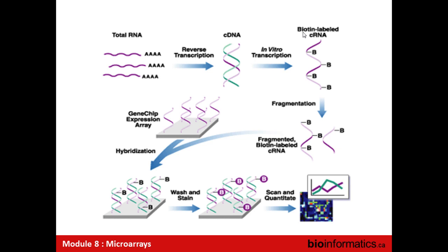Complementary DNA to biotin-labeled complementary RNA. So you need to have double-stranded, and you need to incorporate a label. You need to have a label on your RNA, otherwise you can't do it. So you have to have a step that allows you to label the RNA. If you have RNA, you need a way of incorporating a label. I'm not aware of a robust enzymatic procedure for doing it. You would need an RNA-dependent RNA polymerase to do that, and I don't think there is a robust one. By contrast, there are robust DNA-dependent RNA polymerases. No problem. Other questions on alpha arrays?